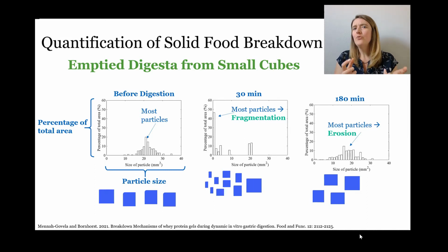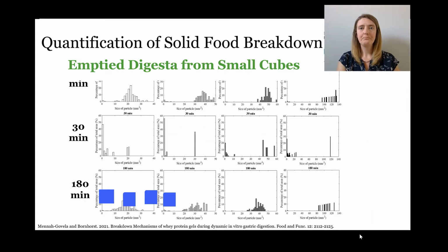And so this is a really interesting approach that you can use, a pretty simple method to quantify some of these mechanisms of breakdown that will help you understand both the emptying rate as well as how these nutrients will be released from the matrices.